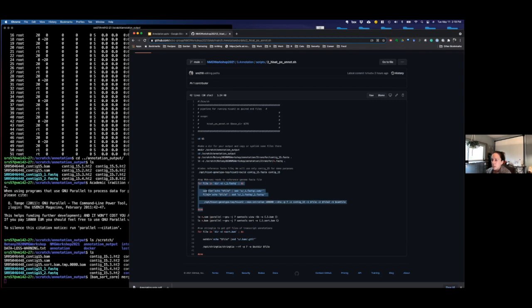So it's just creating some variables. This is a variable for the output file name, and this is a variable for the second file in the paired end mate. So it creates those read names, and then here's where it actually runs HiSat, using the variable names that we created up here. You use these variable names so that you have a different output file for each input file. Otherwise, you're just going to overwrite things as it goes through. So it's important to have a different output file name in these loops.